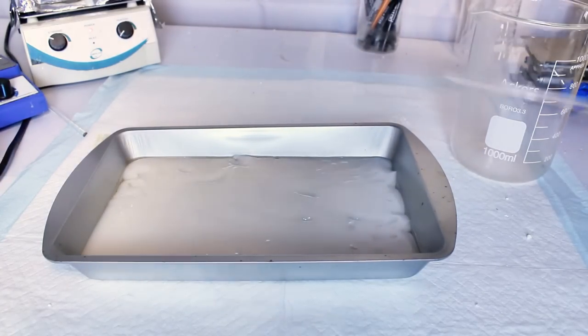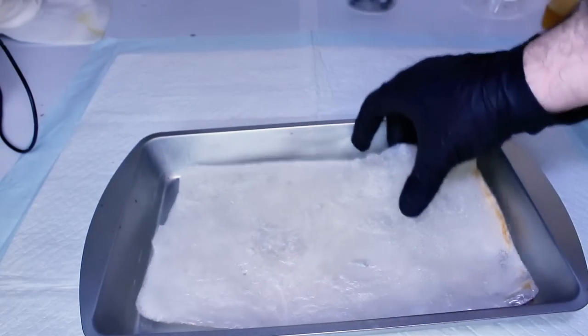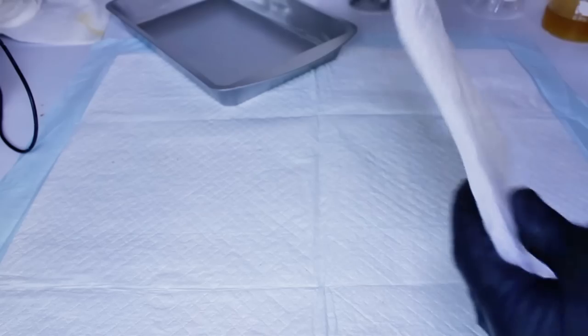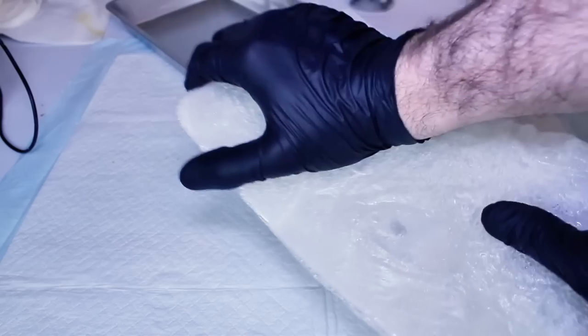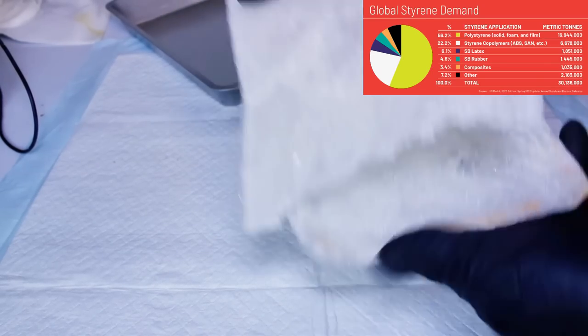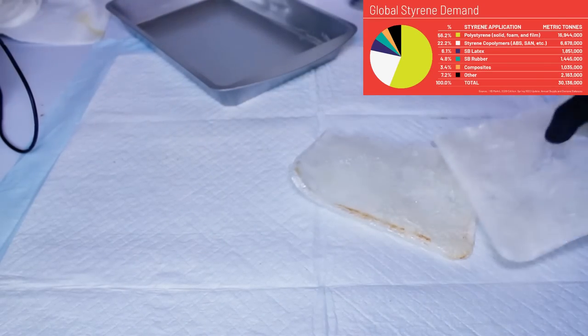When polystyrene is recycled, the only real viable route is by thermal depolymerization to its monomer, styrene. Styrene can then be upcycled back into polystyrene, or it can be made into countless other chemicals, which is what I'm going to demonstrate today.